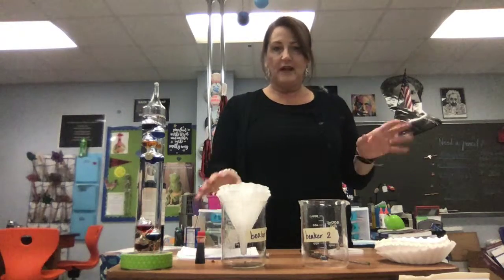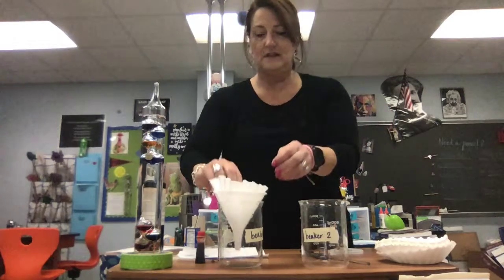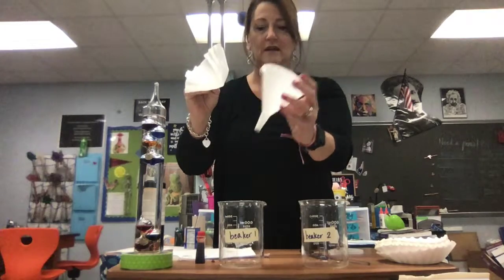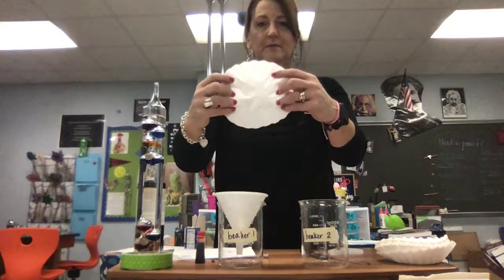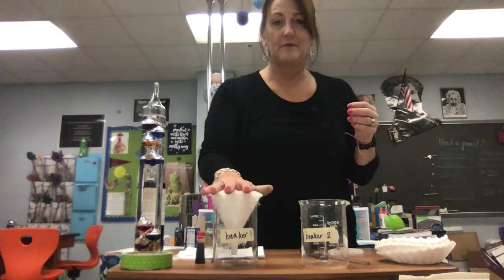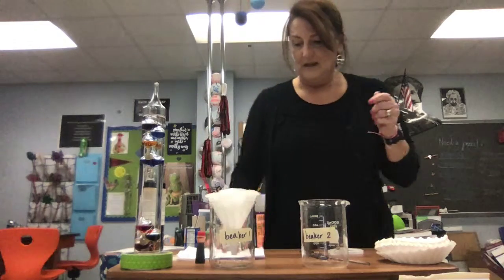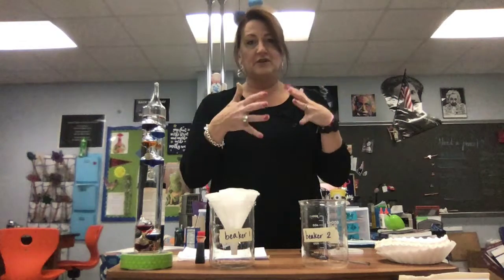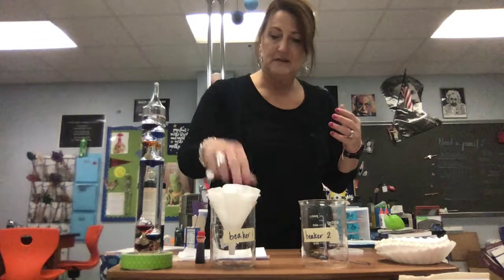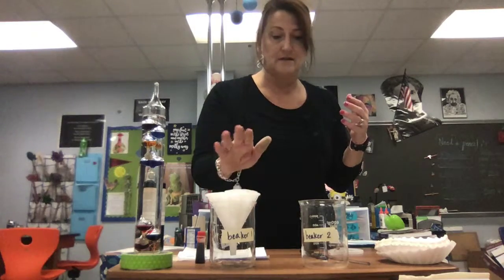Okay, so the setup is, this is beaker 1. You can see it is just an empty beaker and a funnel and filter paper. So think about what you think this filter paper represents. Given we're doing the urinary system, and you have a particular organ within your urinary system that filters your blood, I think you could hopefully figure out what beaker 1 is.